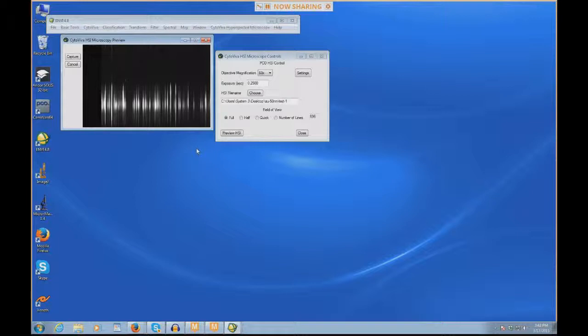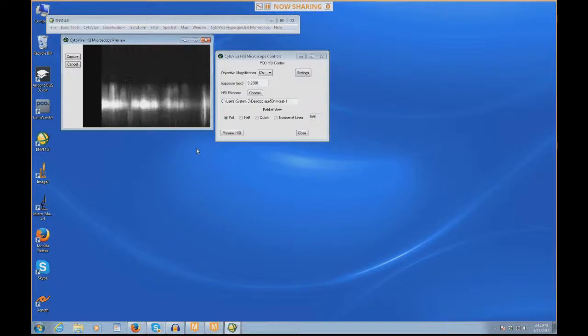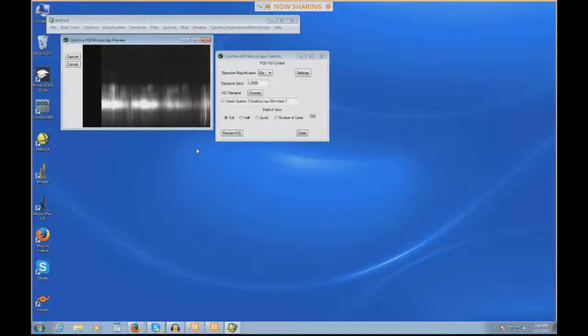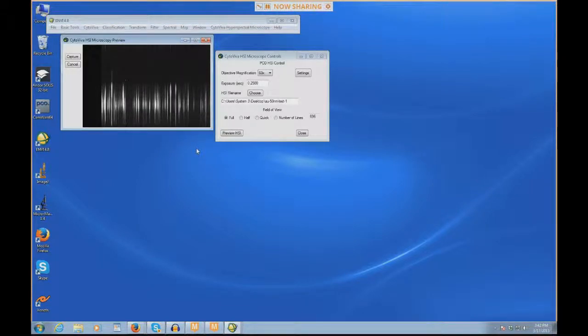Another thing you'll notice about these lines is they're very thin. This means that the particles are actually in focus. I'm going to put my hand on the microscope, find the focus knob, and actually make these particles go out of focus. This is what out of focus data looks like. It's fuzzy, it's blurry. There's no borders or any kind of definition to these particles. As I focus back down, we see these lines get very tight, very well-defined. This represents in-focus information.